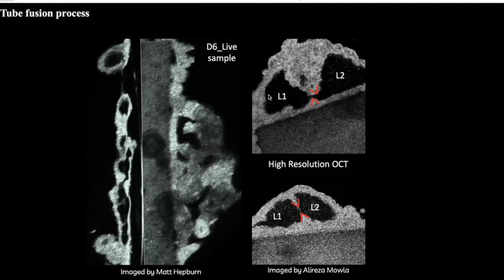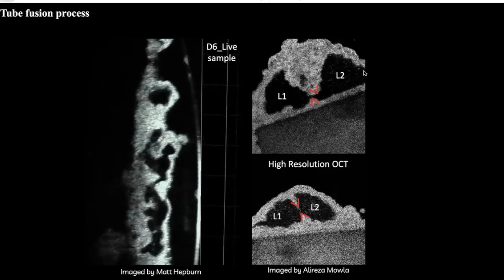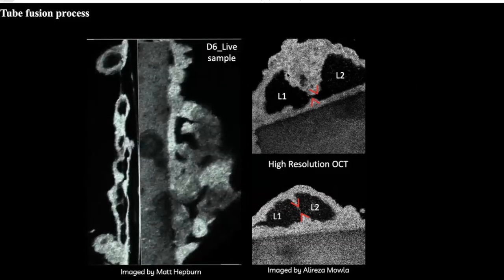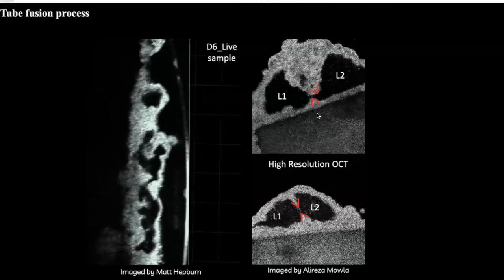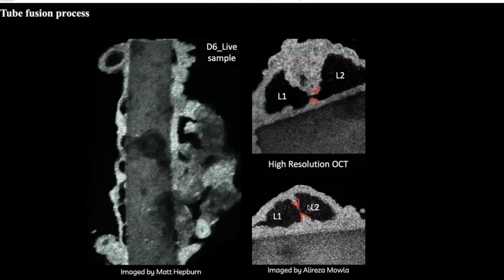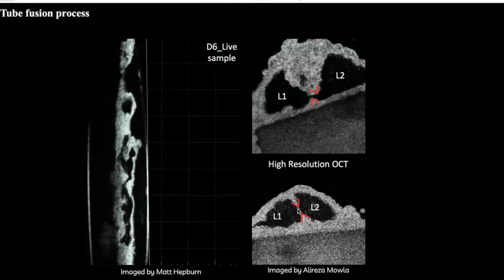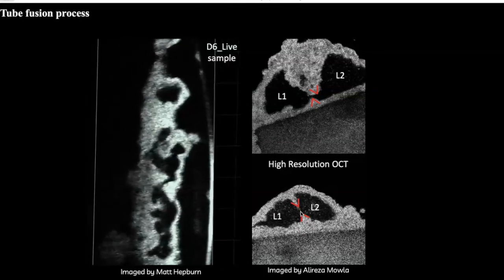And this is a zoom where you have one lumen here that connects to another one, and this is a bunch of cells. Most of them are a monolayer of cholangiocytes, and the rest are some other cells. And so now you have this anastomosis of the spherical lumens that connect to each other through these tiny connection zones.